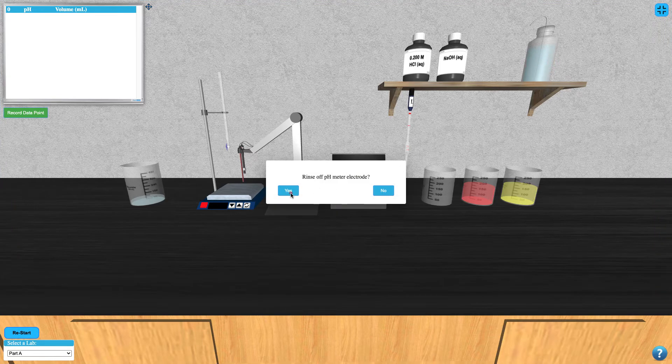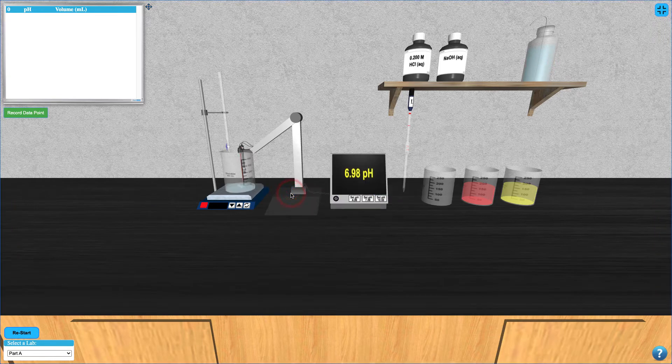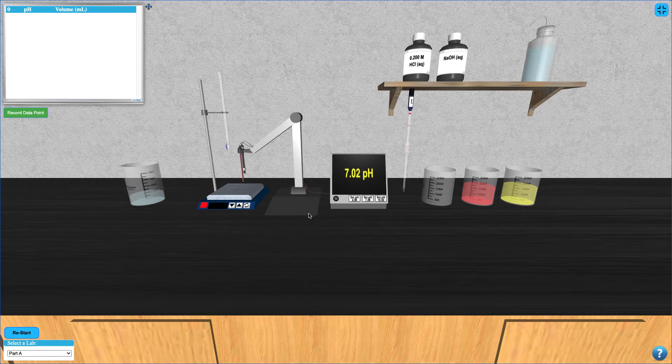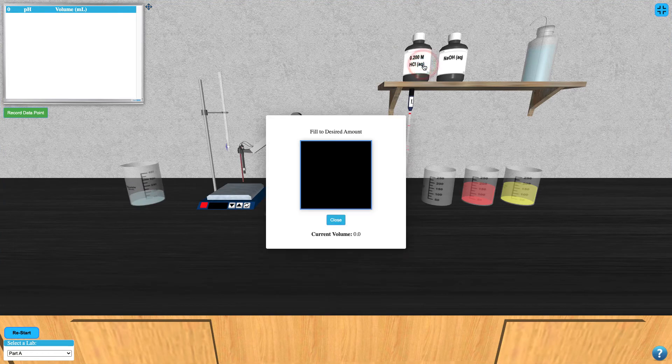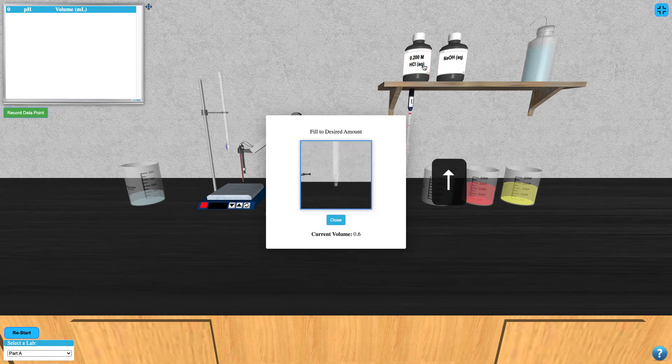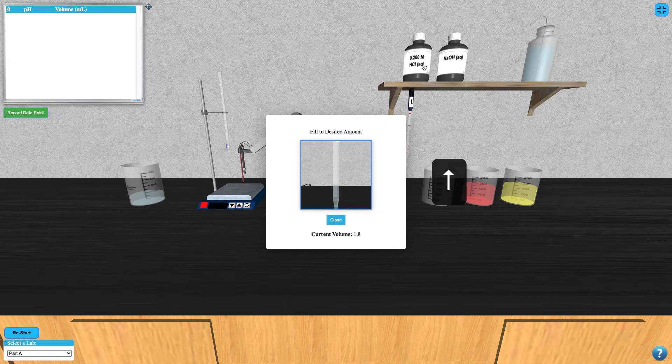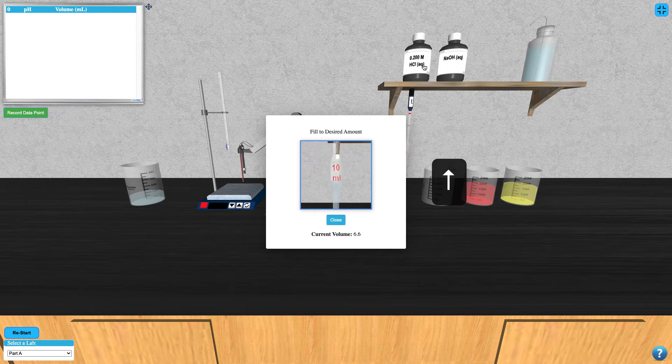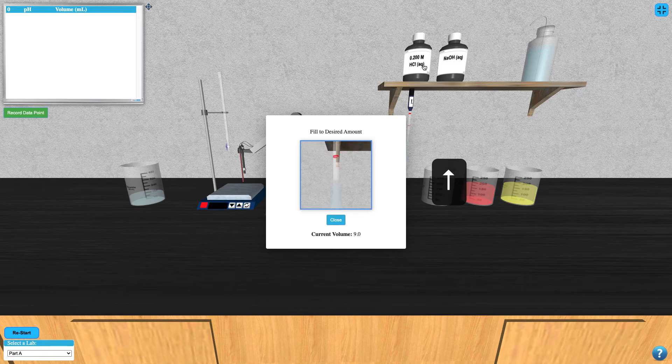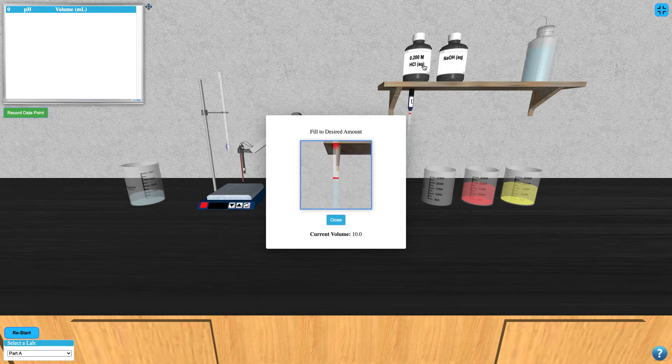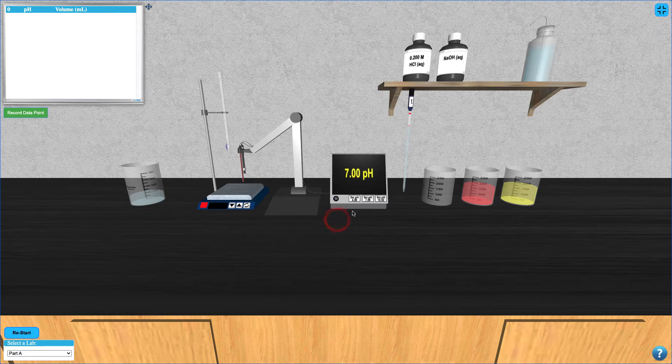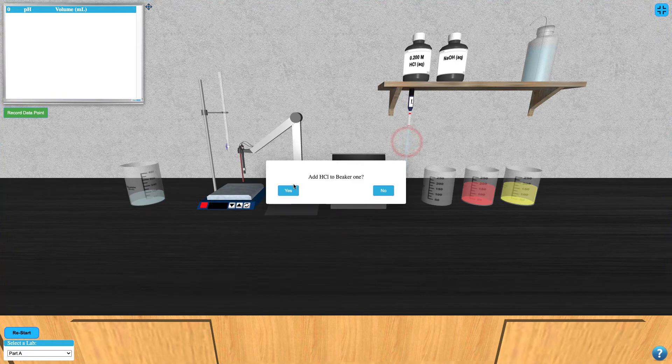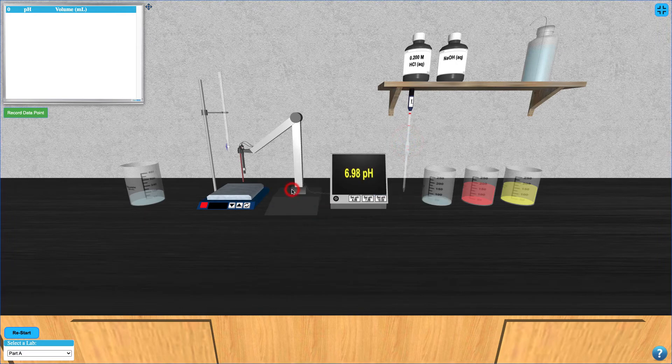Click on the deionized water bottle again to give the pH meter a second rinse. Now click the HCl bottle and add 10 mL to the pipette using your up arrow key. Click the pipette to add this to your sample beaker.